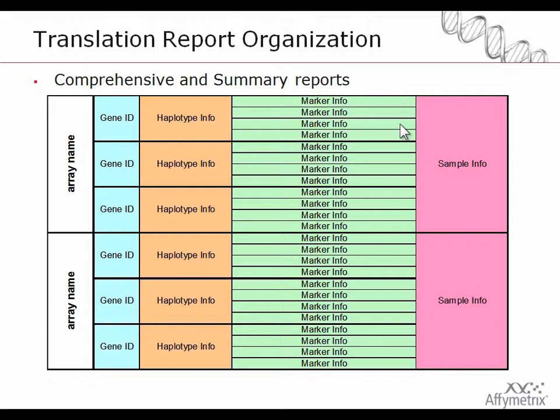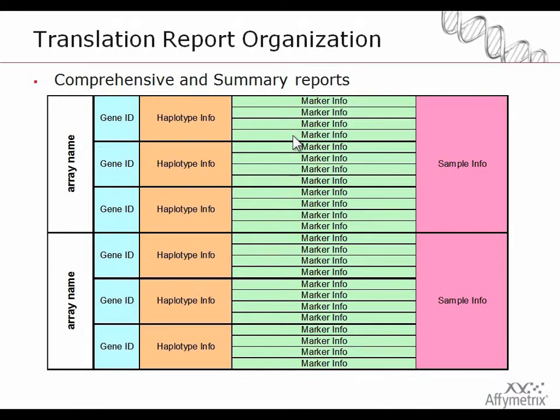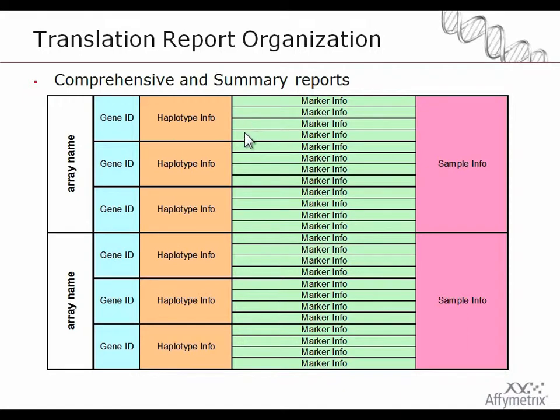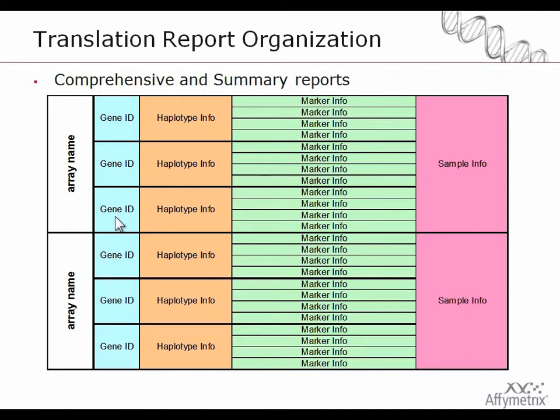Before I show an example of the summary report which is very similar to the comprehensive report, I thought I'd show you the structure. Basically it's a regular table. One row for every marker that's being used for translation. Those are the green rows. Because a set of markers is used to call the haplotypes, the star alleles, there's one block of information that summarizes the information from all these markers into one haplotype call. And there's one of these haplotype blocks, haplotype names, for every gene. And there's a set of genes that are being translated for a particular chip or array name. And if you include the sample attributes, that information will appear at the end.